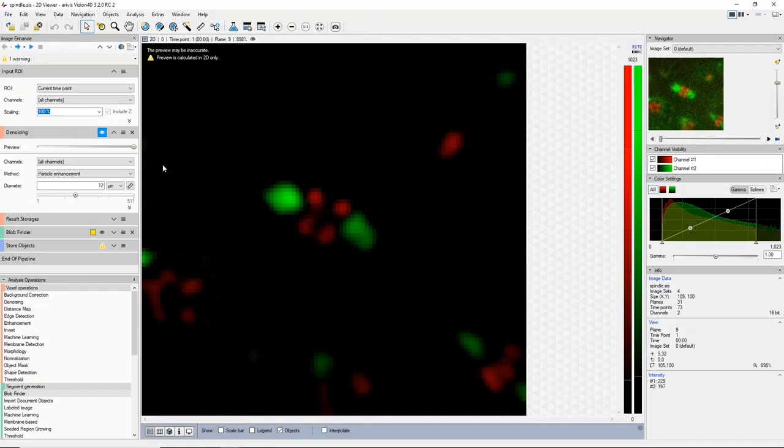Again, it's just about making it really easy for everybody to see that what they're doing is providing the right results. So we've made all these changes, and as I said, with the denoising filter, by default, these operations run in 3D. But if you still want to run these operations in 2D because it's faster, or because you've only got a non-ideal Z separation, in the operation menu, there are additional options.